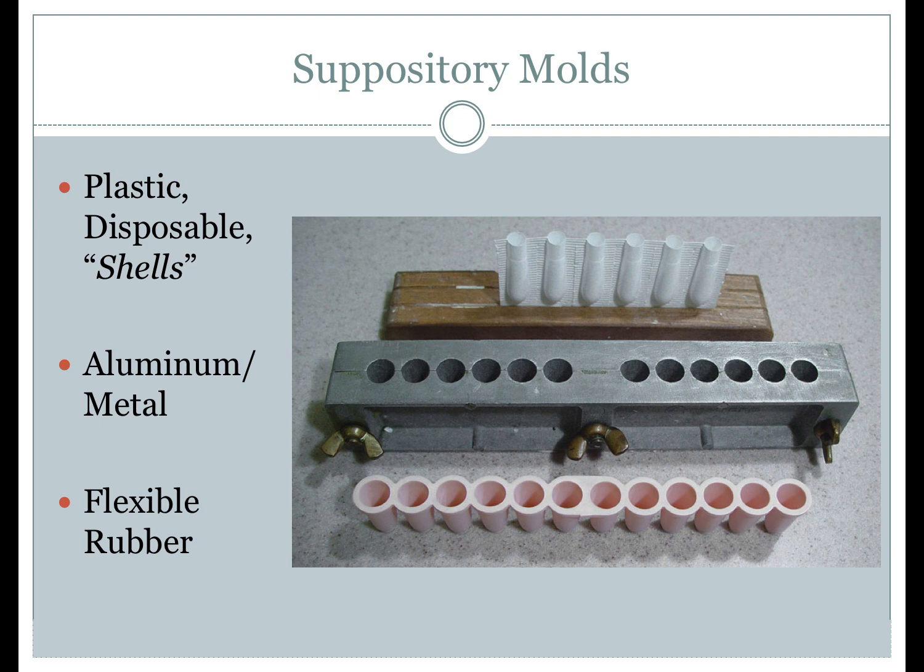The mold has space at the top for overfilling that must be trimmed off prior to dispensing. Therefore, the suppository shell should be removed and the suppository trimmed and then either wrapped in foil or placed in a suppository box for dispensing. However, some pharmacists use a very sharp blade to cut off the overfill while the suppository is still wrapped, allowing them to dispense the product without removing them from the plastic shell.